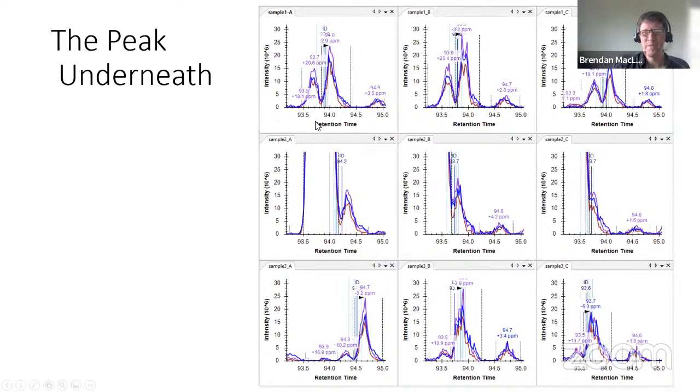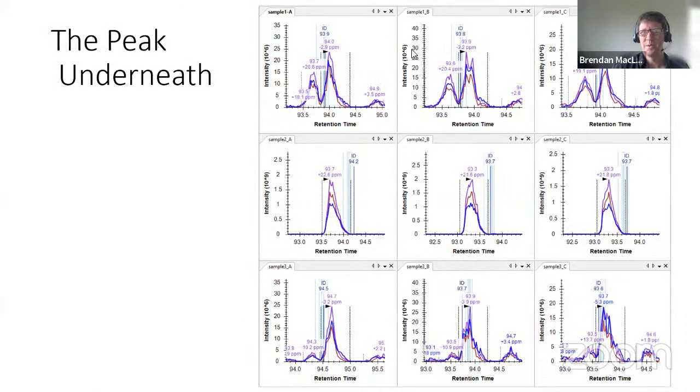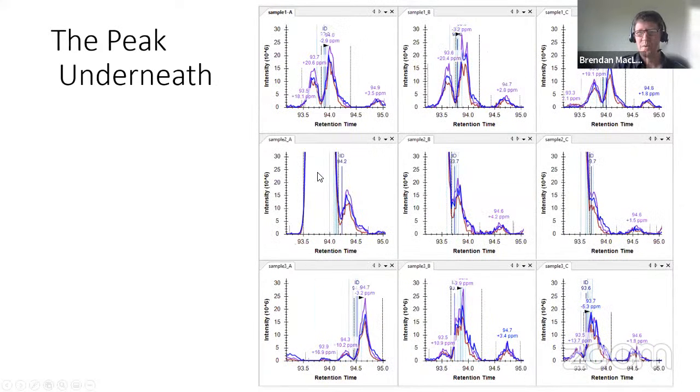So the thing that's changing here is probably not the peak to the right, which is the thing we're interested in, but this peak to the left. And we might really go, wow, what's that? I hope I can figure out what this is, because that is changing very significantly, but not the thing that we were hoping to measure.